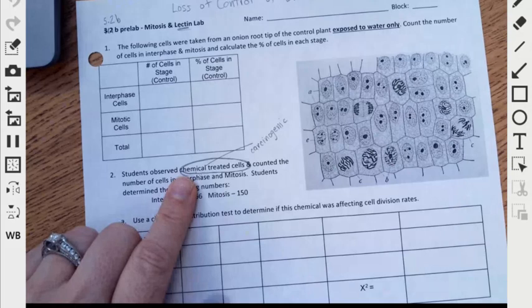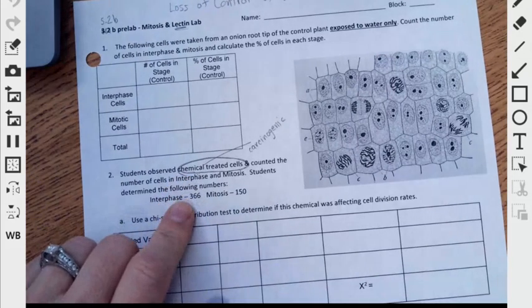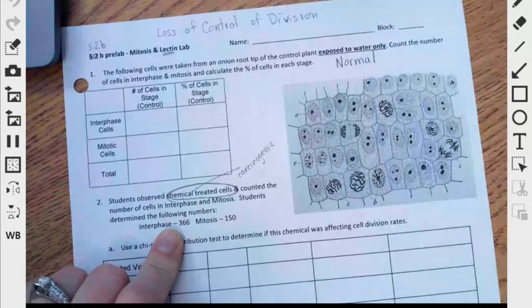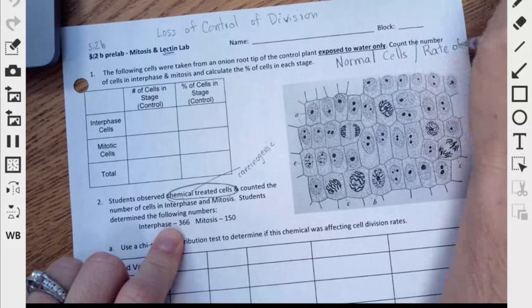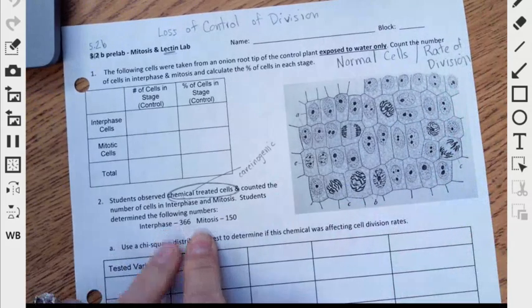Is it carcinogenic? Well, if we want to see if cells are dividing normally, we have to look at cells that are dividing normally first and compare them with these cells that have been exposed to the chemical. And that's what this picture here is. It says that these are cells that have only been exposed to water during this time. These are the normal cells, and they're going to show us the normal rate of division. And then we can use their information to compare it to these cells that have been exposed.